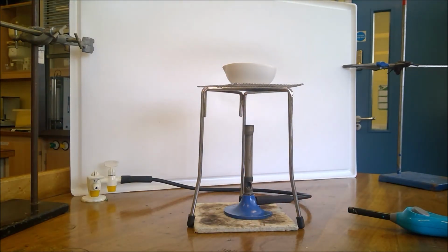Now we're trying to make salt crystals. So what we want to do is heat our solution until we see crystals starting to appear at the edges. At that point, we're going to have a saturated solution. So it's got so much of the salt dissolved in it that it can't quite hold it all. And then as we remove a little bit of water, some of the crystals are having to come out of solution. And as we drive off more water, obviously we'll have more crystals forming.